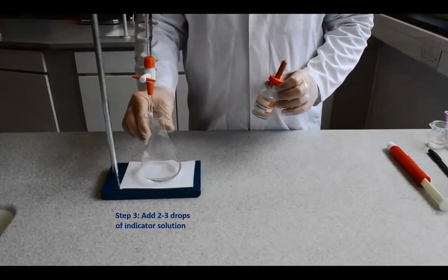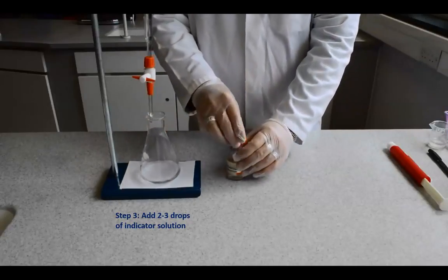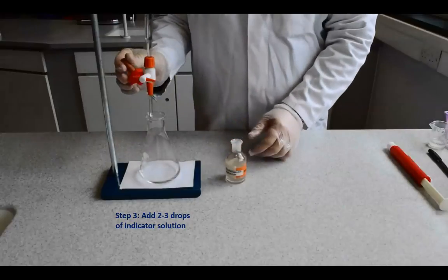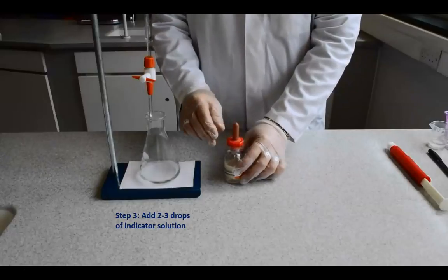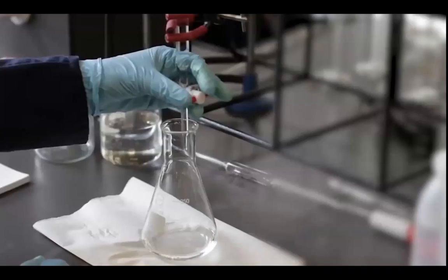He has phenolphthalein in his hand. It remains colorless in the acid. The indicator could also have been added before placing the flask under the burette. The flask should be placed so that the tip of the burette is well inside the neck of the flask.